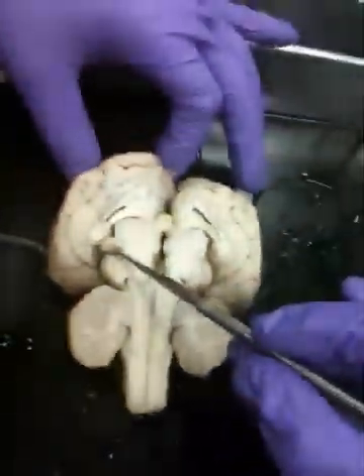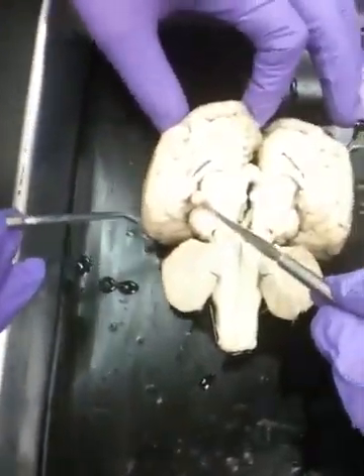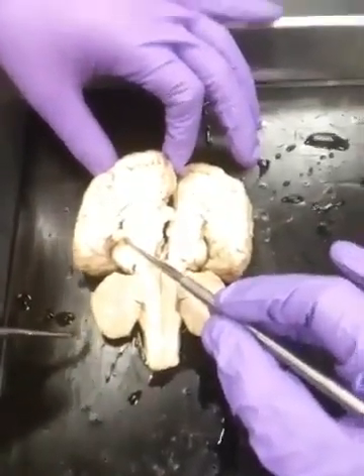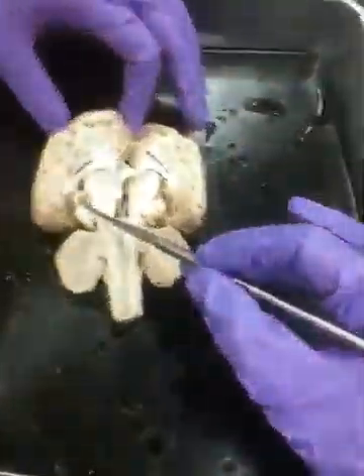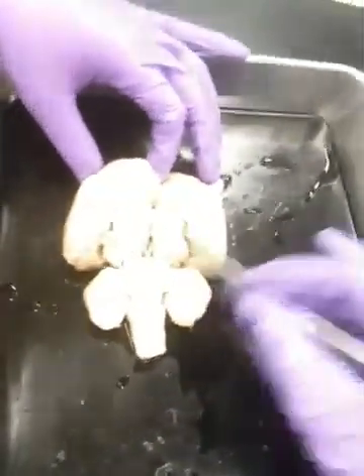I think I'm guessing it's the pineal body, right? It releases melatonin, its main function for sleep-wake cycles, and I think that must be because sheep, like most animals, are more profoundly affected by circadian rhythms than we are. I'm imagining. I don't know why theirs is huge. Ours is not that large by comparison.